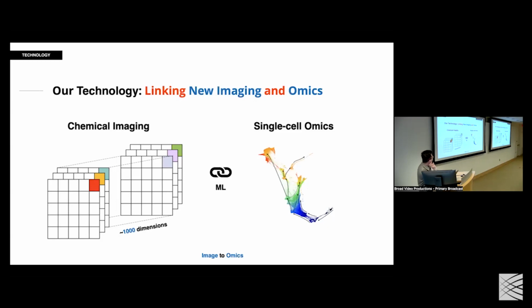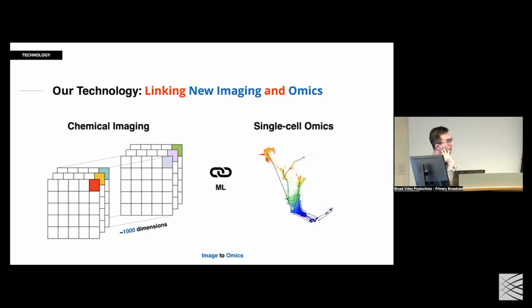But here today, Charles will talk in a little more detail about how we think about imaging methods beyond just traditional fluorescent or bright field imaging. That's why we were thinking about how to link new imaging modalities with all kinds of omics data. Specifically, the imaging method that we are interested in is called chemical imaging. It's a very high dimensional measurement, which is not quite popular in biology yet, but it measures super high resolution and high dimensional information per pixel. This one, for example, can give us up to 1,000 dimensions per pixel.